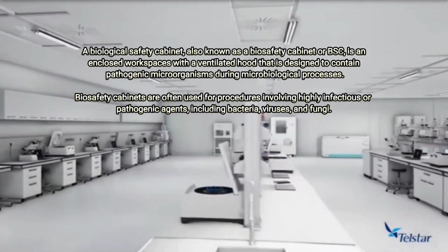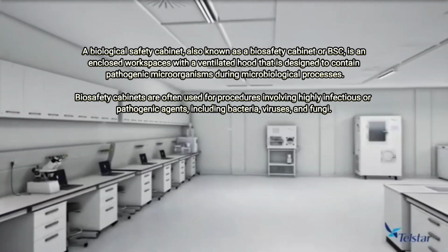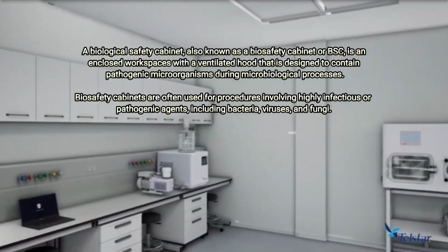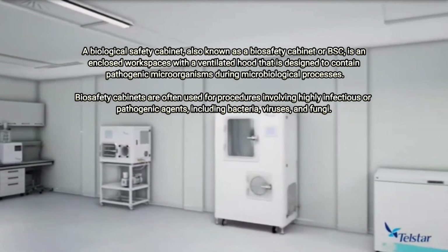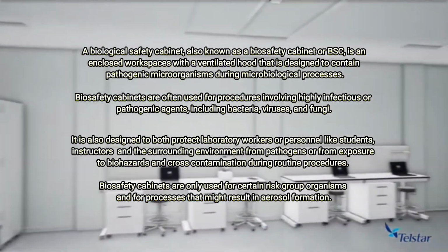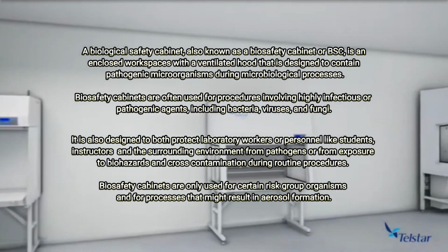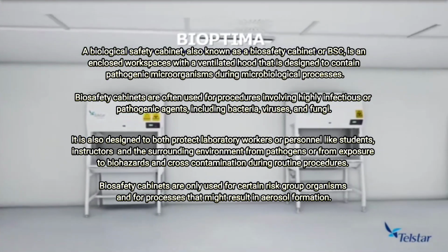A biological safety cabinet, also known as a biosafety cabinet or BSC, is an enclosed workspace with a ventilated hood that is designed to contain pathogenic microorganisms during microbiological processes. Biosafety cabinets are often used for procedures involving highly infectious or pathogenic agents including bacteria, viruses, and fungi. It is also designed to both protect laboratory workers or personnel like students, instructors, and the surrounding environment from pathogens or from exposure to biohazards and cross-contamination during routine procedures.